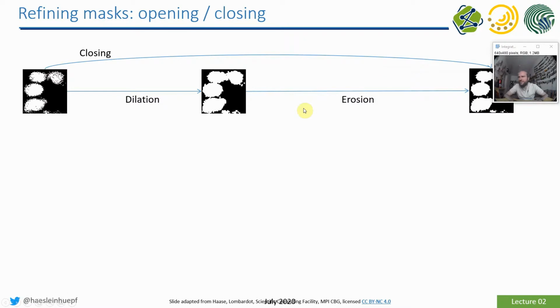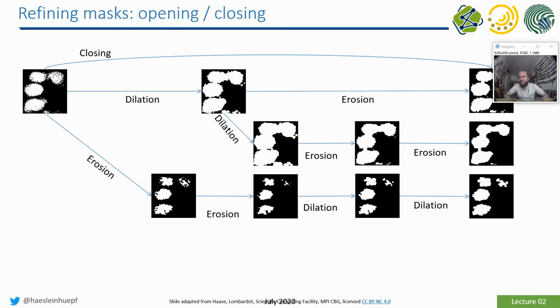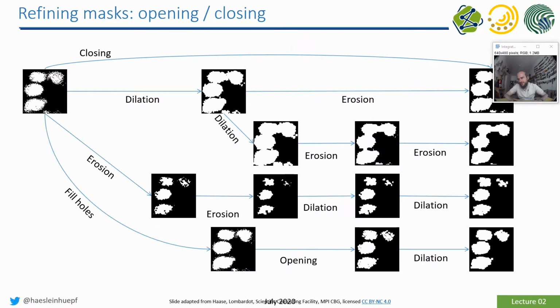And you may remember that there is a quite long list of different combinations of these filters. Maybe you want to open ImageJ, make a simple binary image, for example out of blobs.gif, and apply some binary filters to it in order to recall what they were doing. There's dilation, erosion, opening, closing, fill holes, watershed.